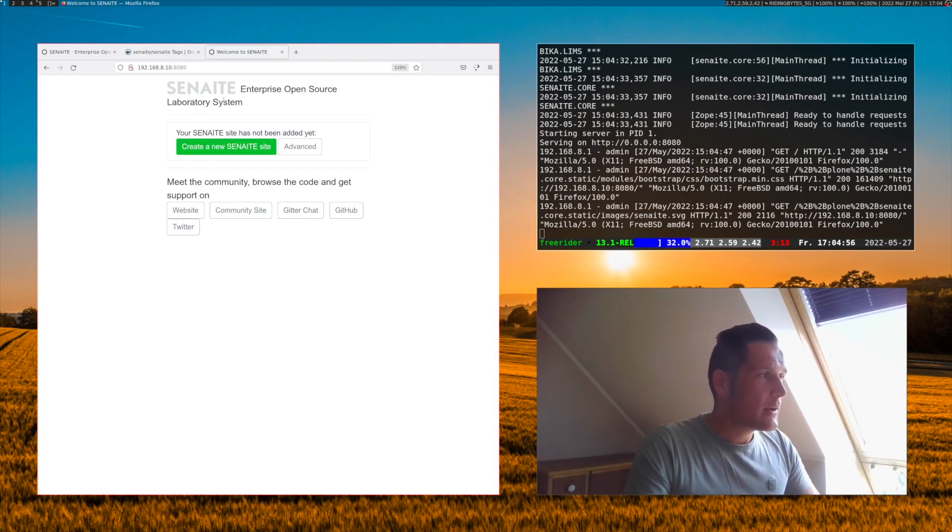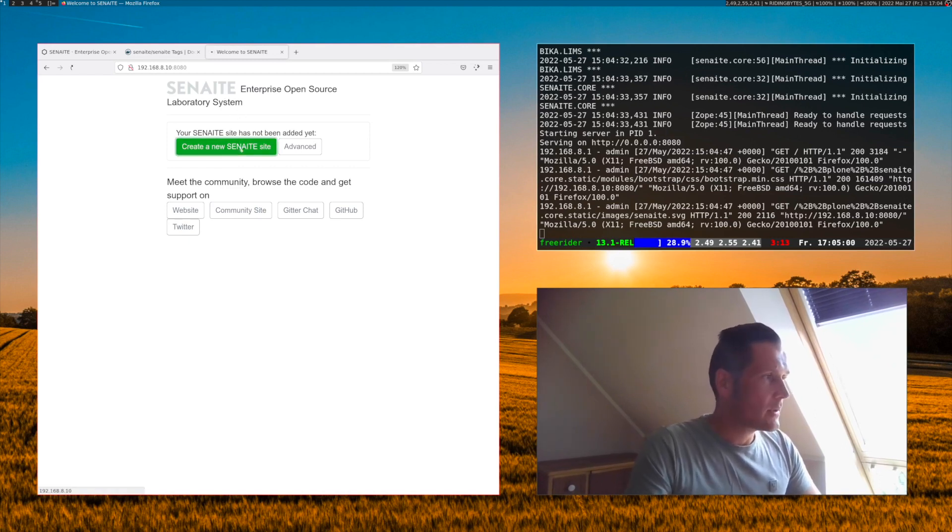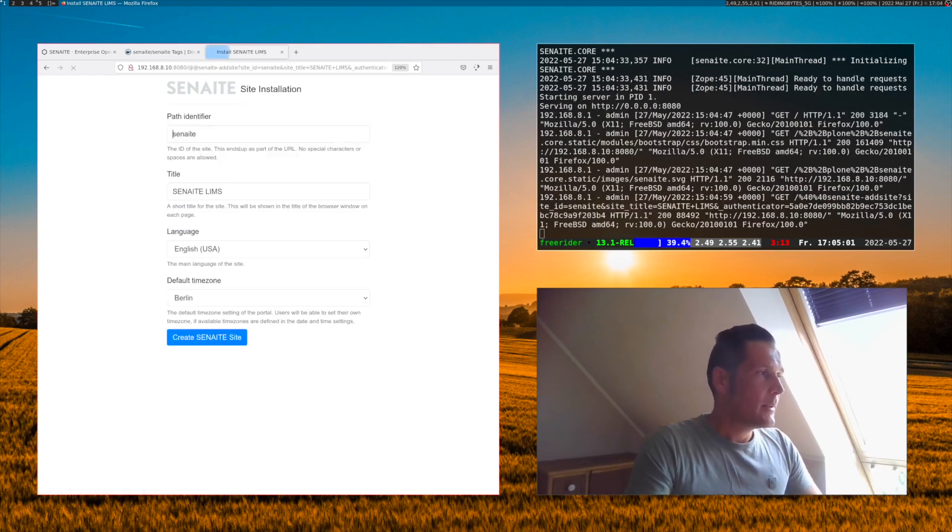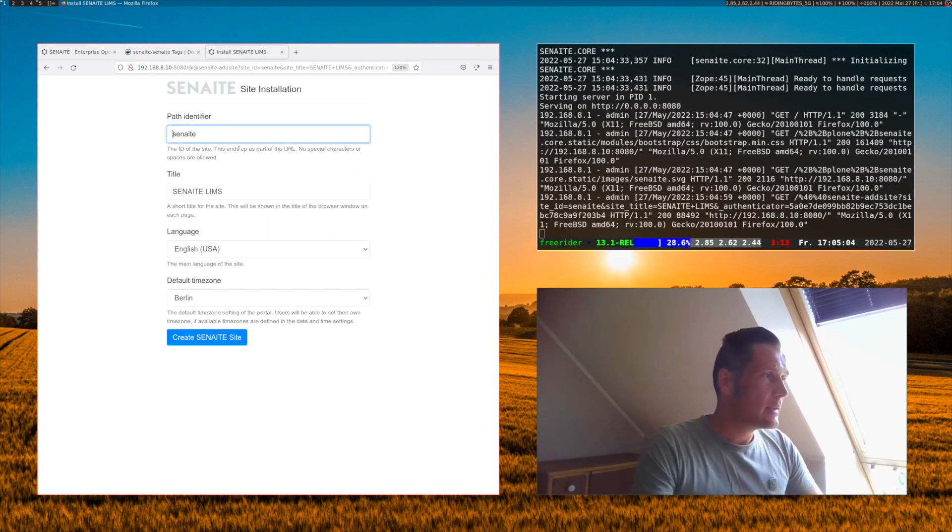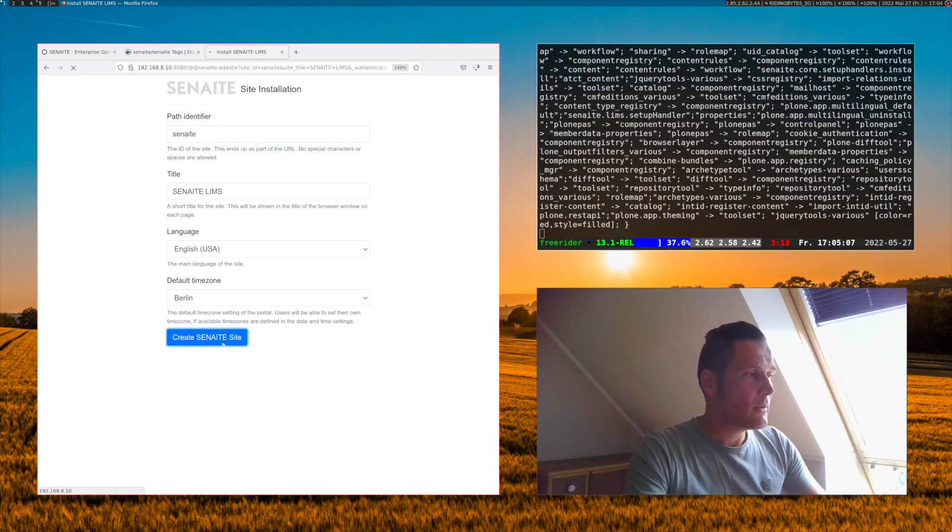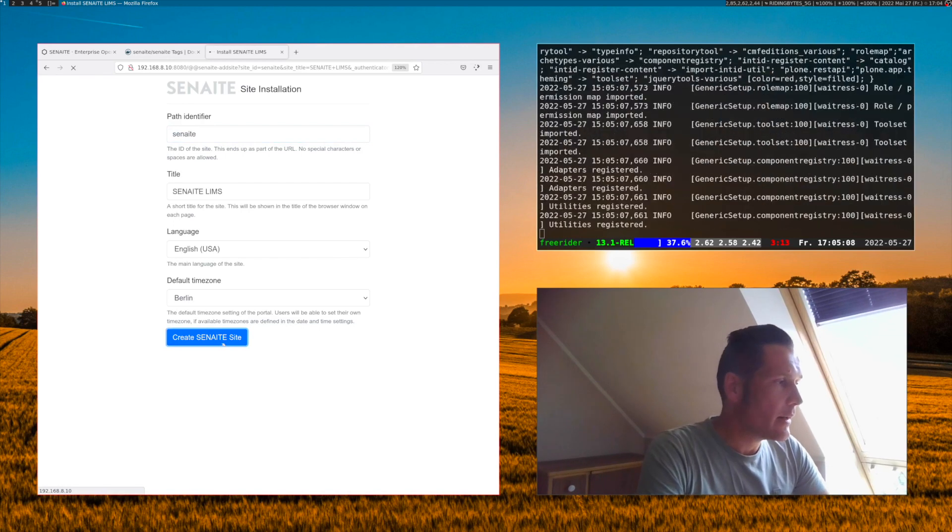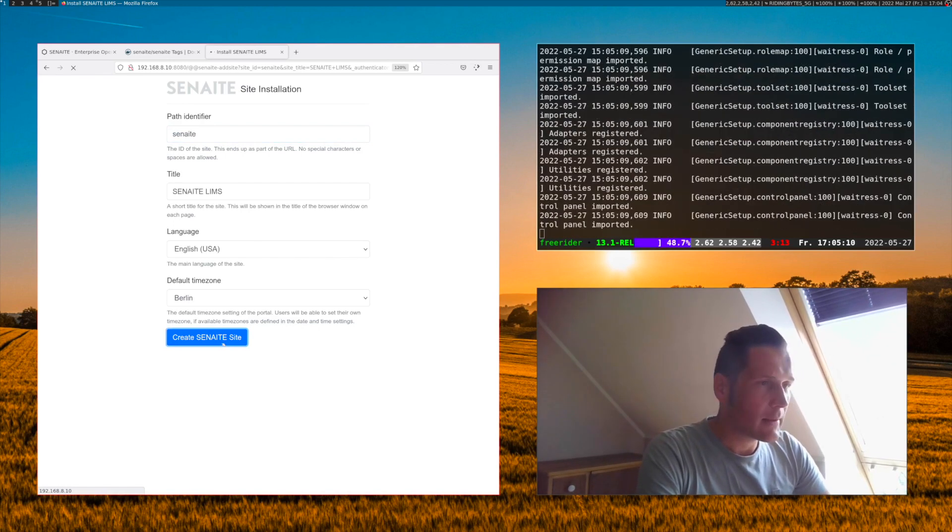We see now here the installation screen for a new Senn8 site because it is not yet installed in the database. Let's create a new Senn8 site and here we can leave the defaults as they are and say create Senn8 site.